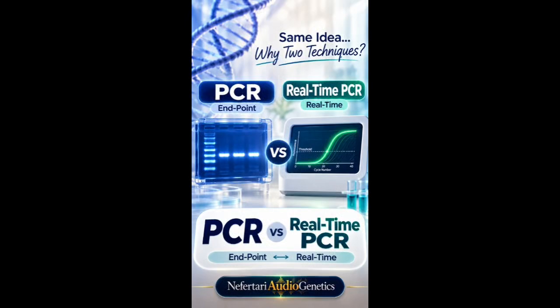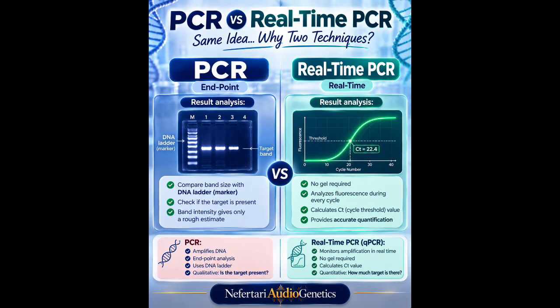If both PCR and real-time PCR amplify DNA, why was real-time PCR invented? The difference is not what they amplify, it's when and how they detect the amplified DNA. Let's start with the conventional PCR.